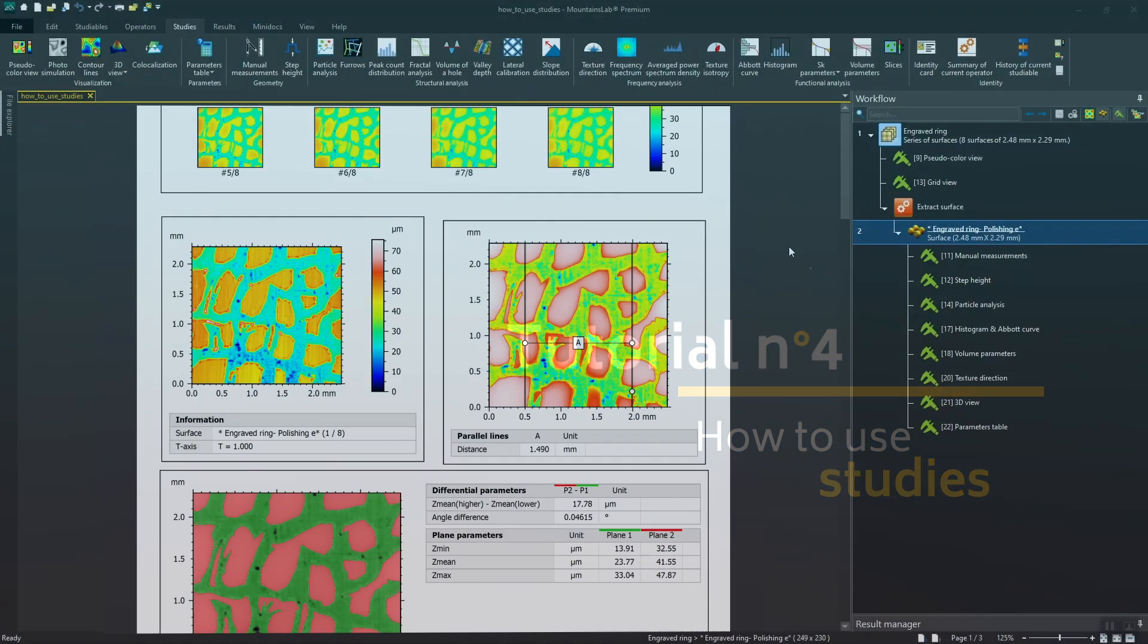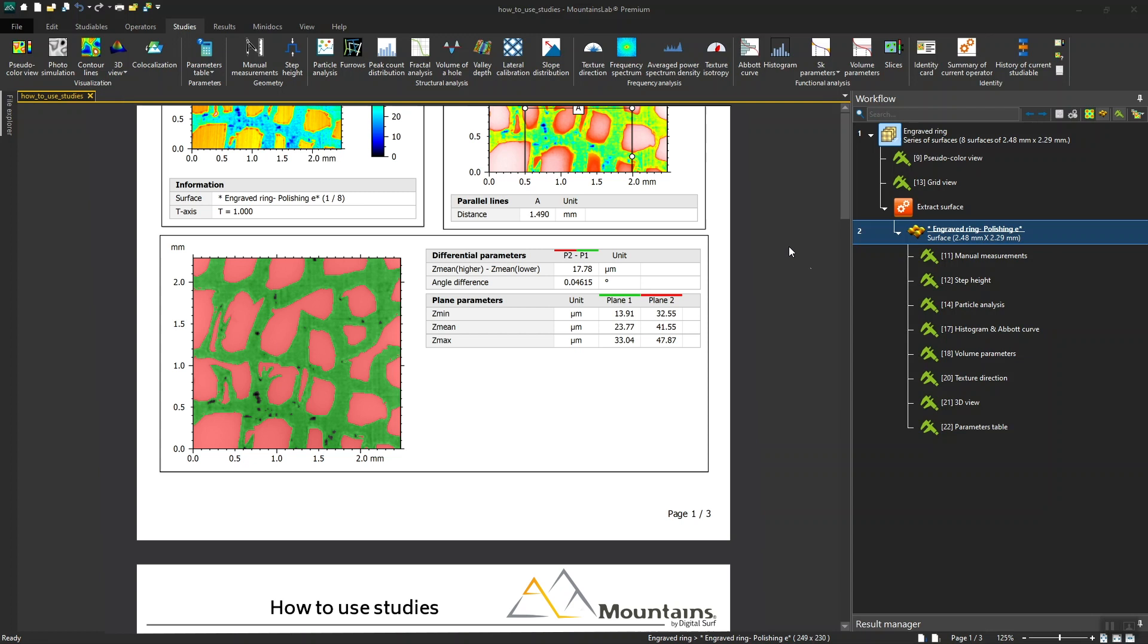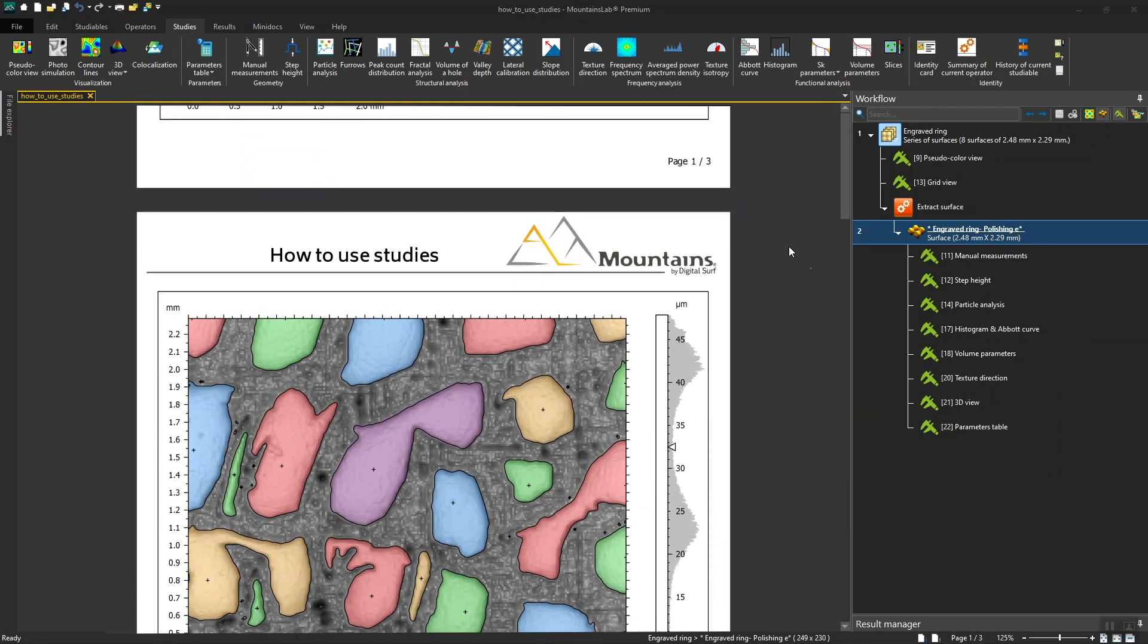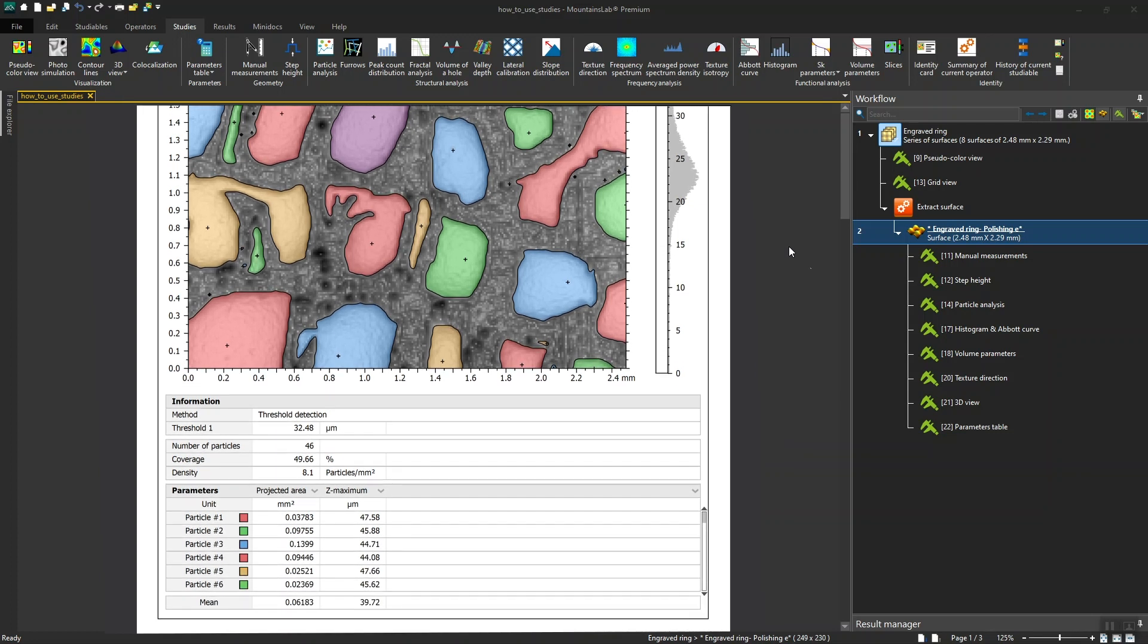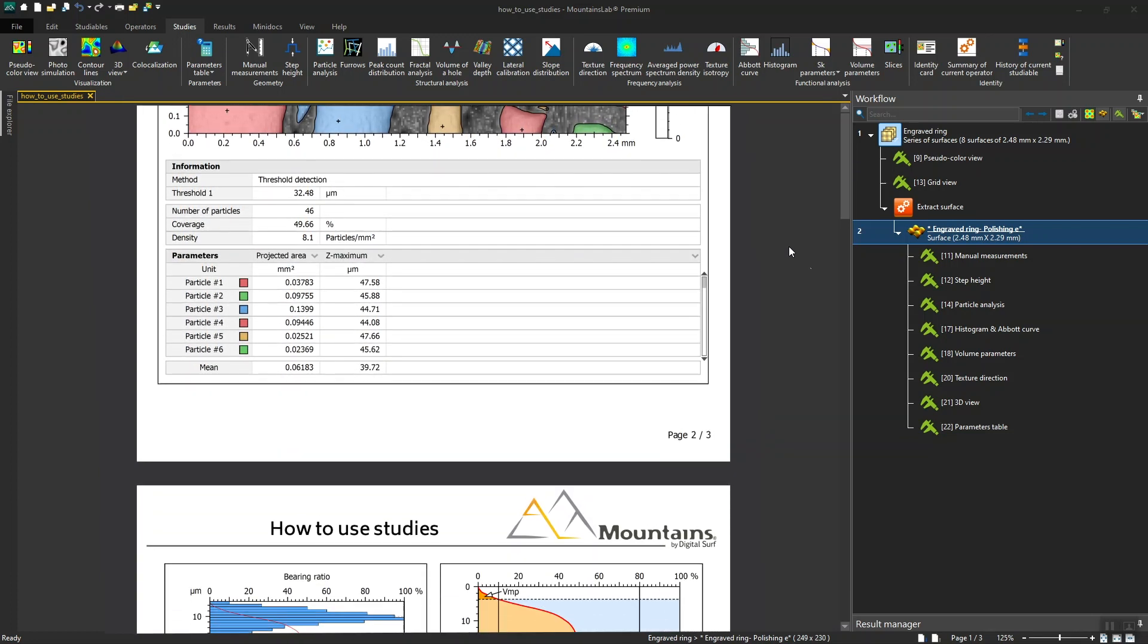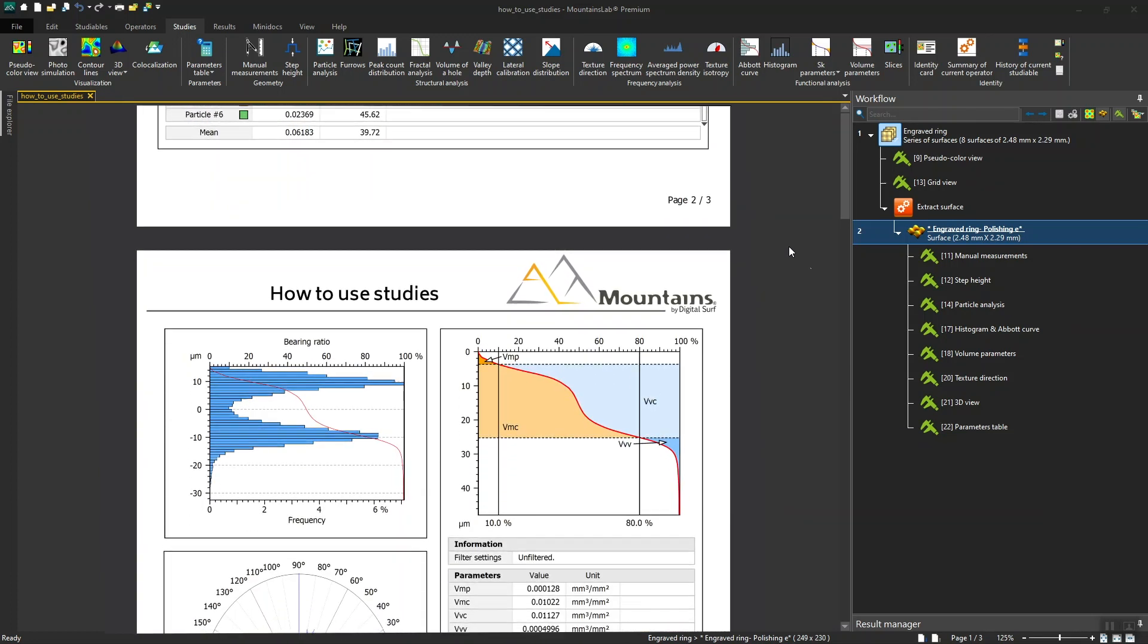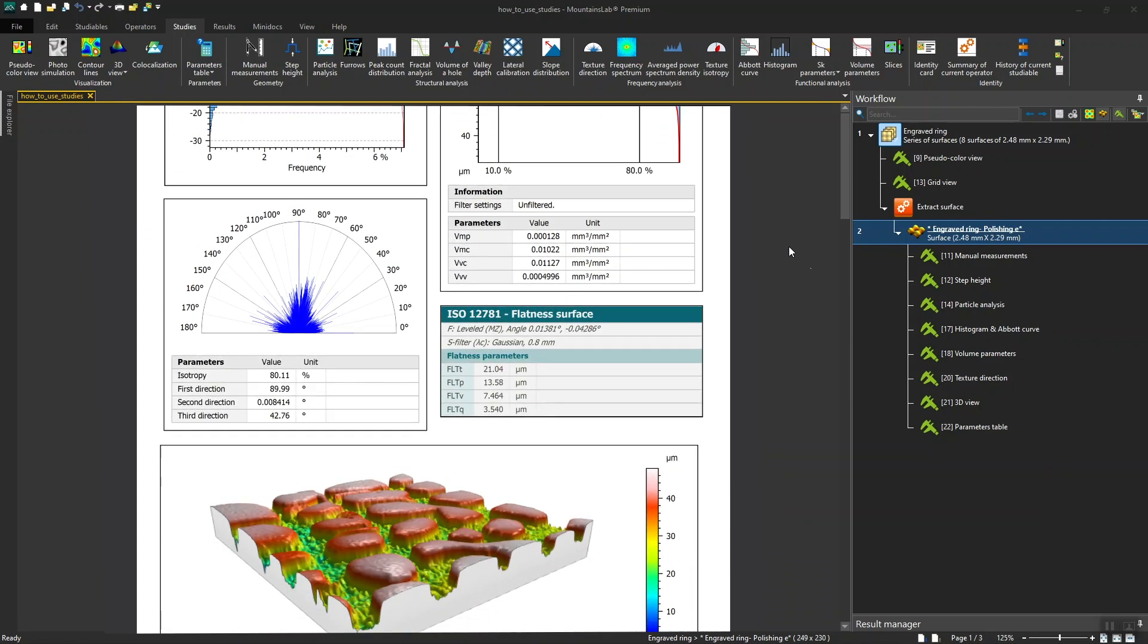In MOUNTAINS, studies are the different forms of analysis carried out on data or studyables. Unlike operators, studies do not modify studyables, but help draw other information from them through visualization or analysis.